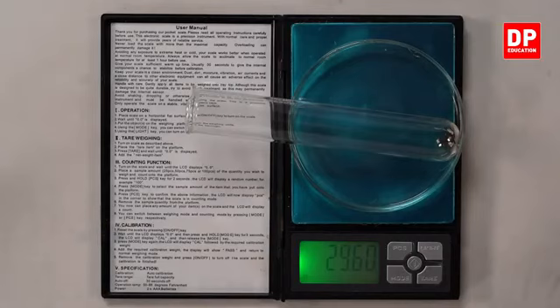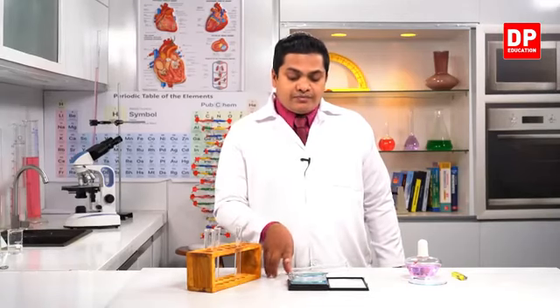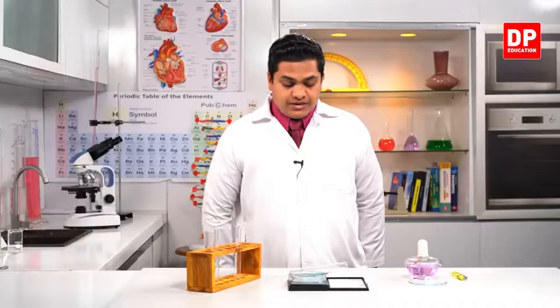By placing it very steadily on the digital balance, I'm going to measure the mass of it. Here it's been printed on the screen 29.60. So the total mass, the entire mass of this boiling tube which contains the matchstick heads, is equal to 29.61. We'll get an accurate answer. Okay, 29.61 is the answer. Okay, right, 29.62. See, it's very sensitive.